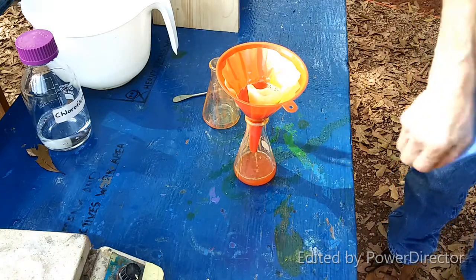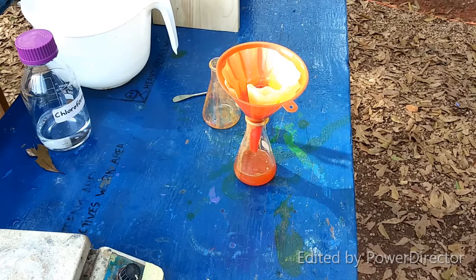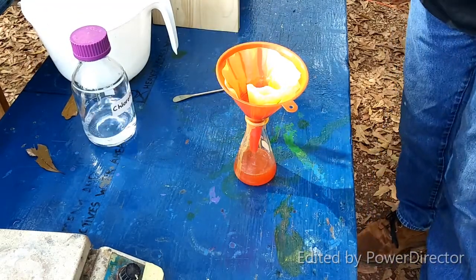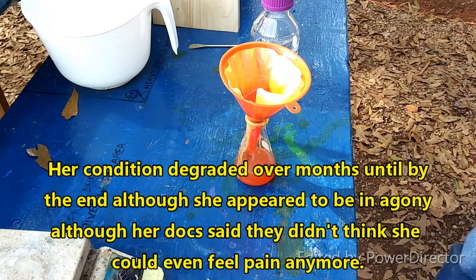I don't know. I'm working under the assumption nitrile gloves will keep me safe, but since I do not know that, I like to change them kind of frequently. I'm 99% sure they work just fine, but so was Karen Wetterhahn. And then her brain turned to cheese. She absorbed some dimethyl mercury. And the prevailing wisdom at the time was that her gloves were sufficient protection. Yeah, not so much. Dimethyl mercury will go through just about everything but really heavy neoprene gloves.